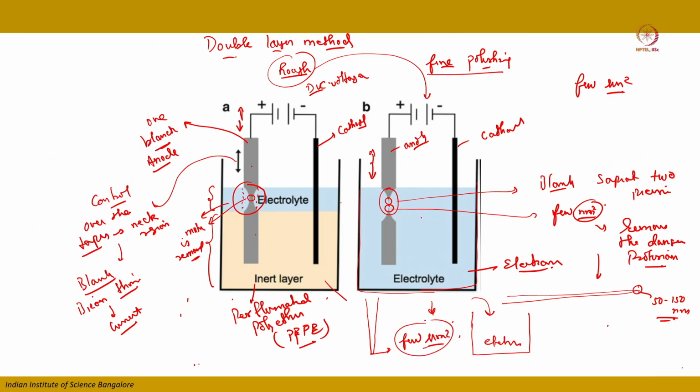This needle specimen then goes to a second step where we use a rig, in which the electrolyte is suspended by using a loop of the cathode. So this is the second step.